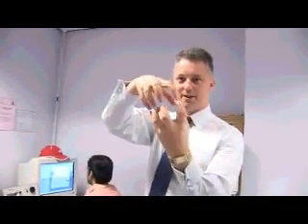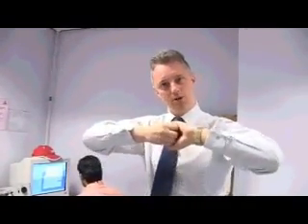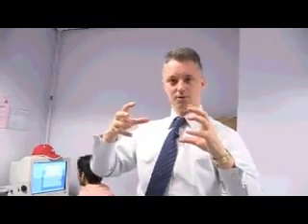This is a slightly different experiment, where, when I was saying we can measure the forces between molecules, that's what Mudasir is doing here. So what we do now is we bring two molecules together. So this is nanotechnology at its best. We're taking two molecules, we're bringing them together, we allow them to bind, just as would happen in our bodies, a sort of biological process, and then we pull them apart. And as we pull those two things apart, in this case it's a vitamin and a protein, we can understand more about the structures of the things as they bind. And that's one of the big questions in biology at the moment, trying to understand how molecules recognize and bind each other, and how the structure of those molecules helps us understand that.